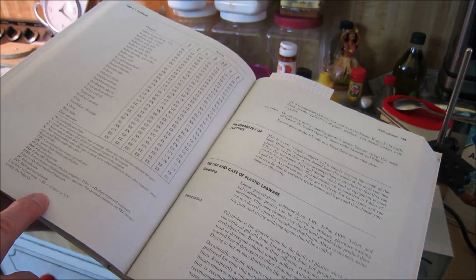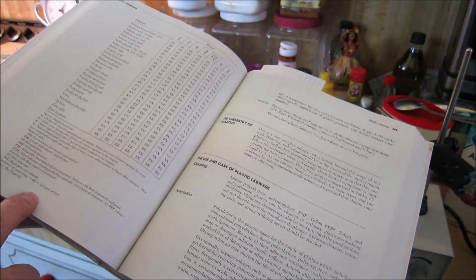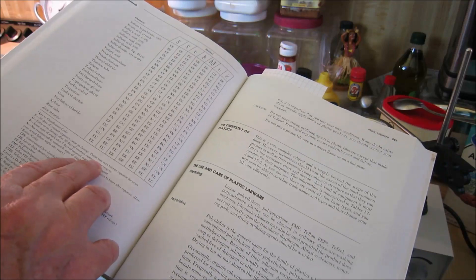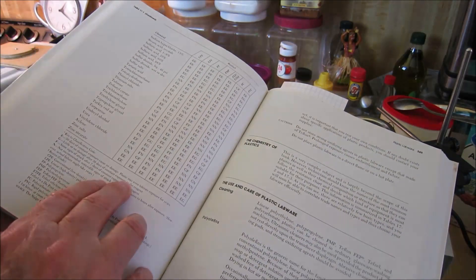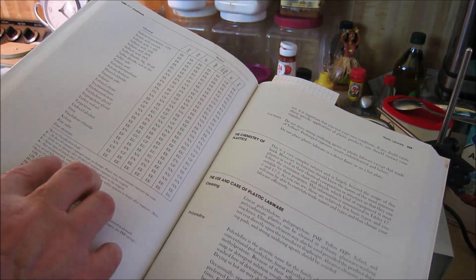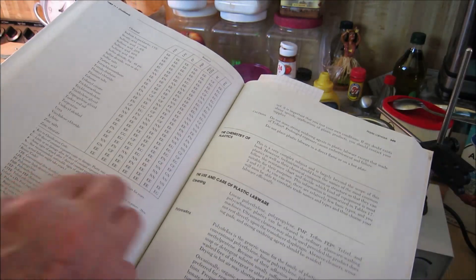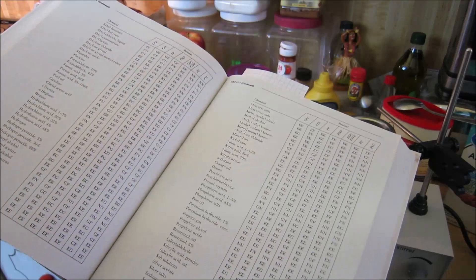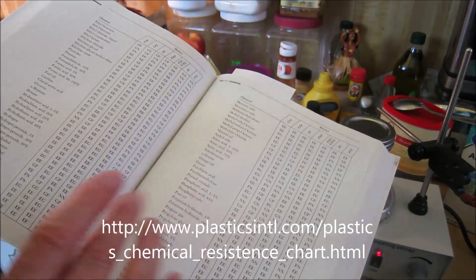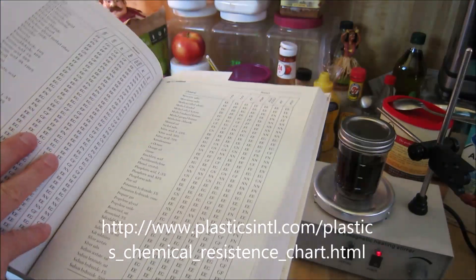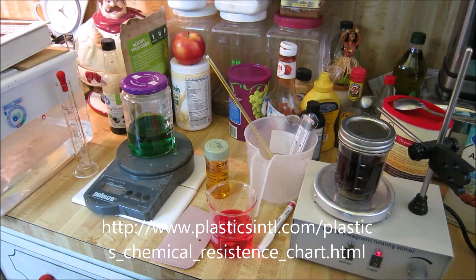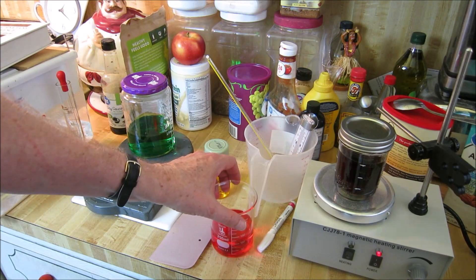No matter what type of plastic you have: polypropylene, polyethylene, teflon, polycarbonate, PVC, and so on. And they tell you whether there is no damage after 30 days or maybe for years, or there's little damage or not recommended. So I'll see if I can find a link. If not, just look up resistance of plastic lab work and you can find out whether different plastics you have available are suitable for you to store.